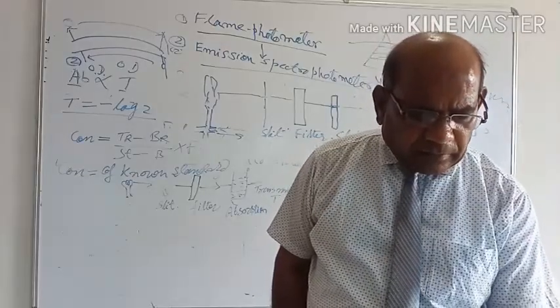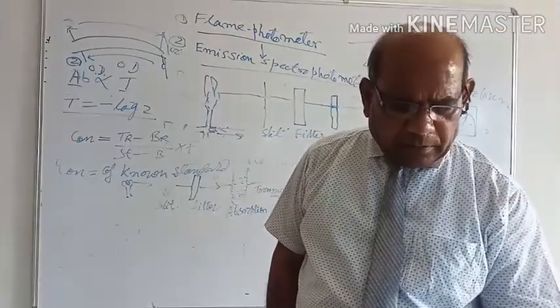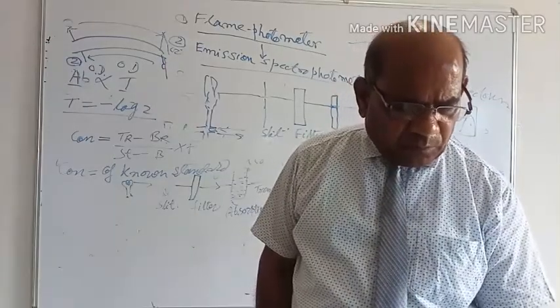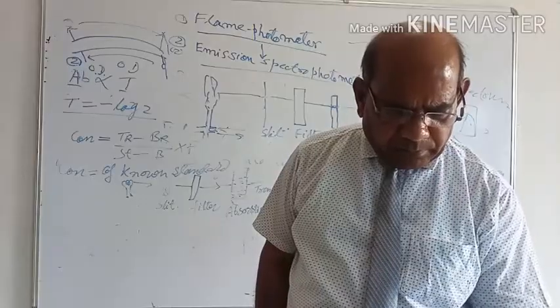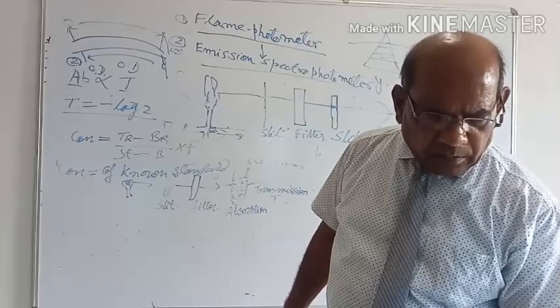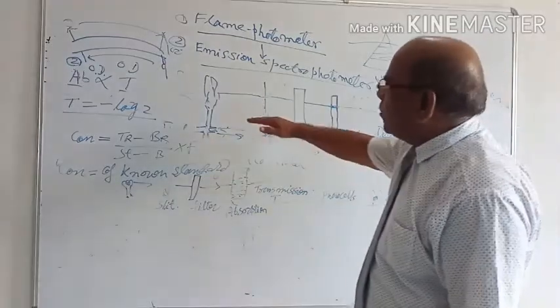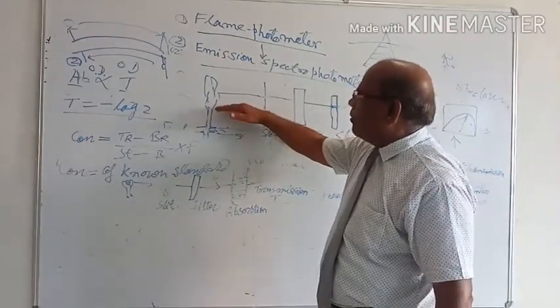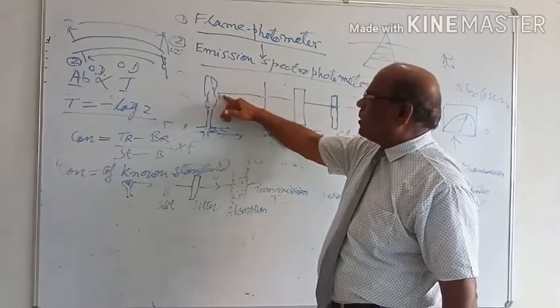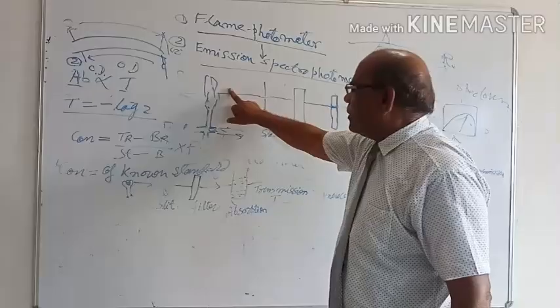Then we put the electrical connection of the instrument, then turn on the air compressor and open the fuel valve. Ignite the flame. First of all, we nebulize or vaporize the deionized water, and this nebulization of water is used as a blank.